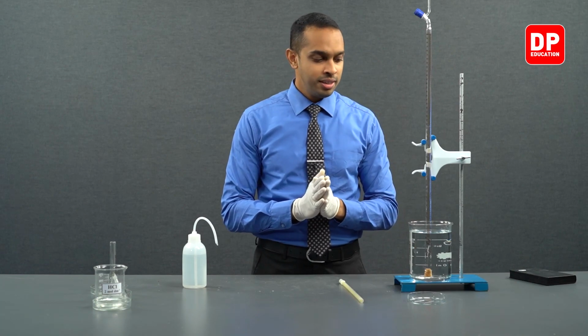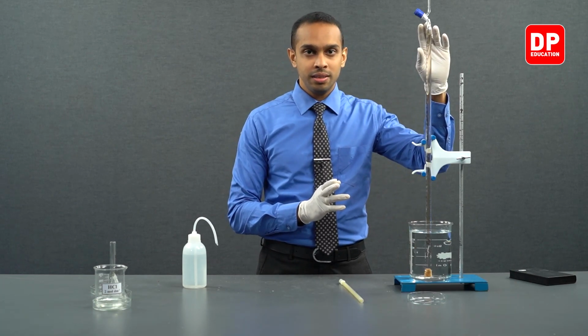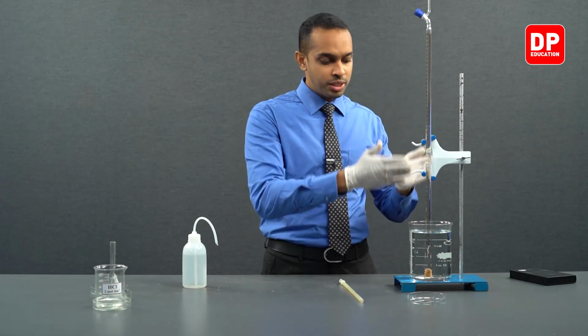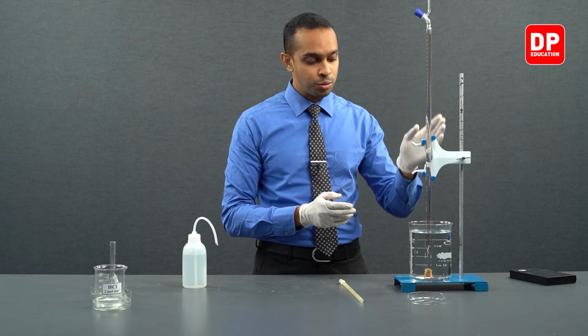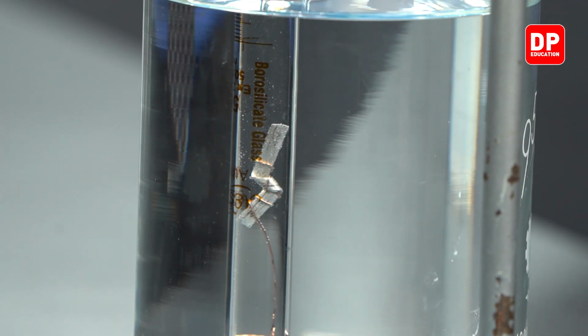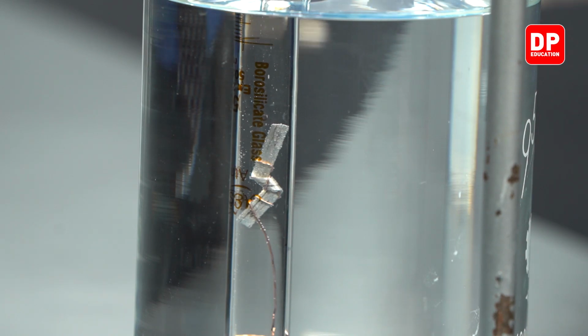Right, we have brought the water level to the 50 milliliter mark, and after we have turned it upside down for a while, you can see the HCl that was present here at the bottom of the burette now starts reaching down because we have turned the burette upside down. So HCl was present here. It is now starting to reach our magnesium strip. And as it reaches the magnesium strip, we can see a reaction taking place and production of hydrogen gas.